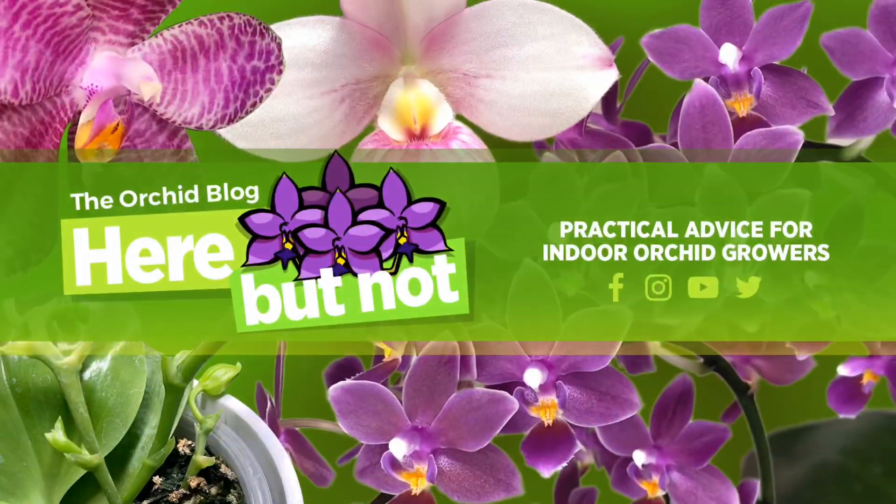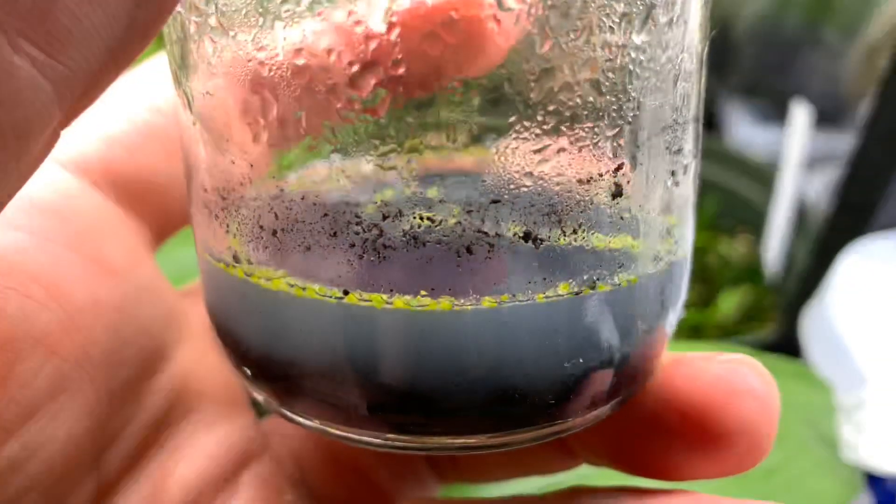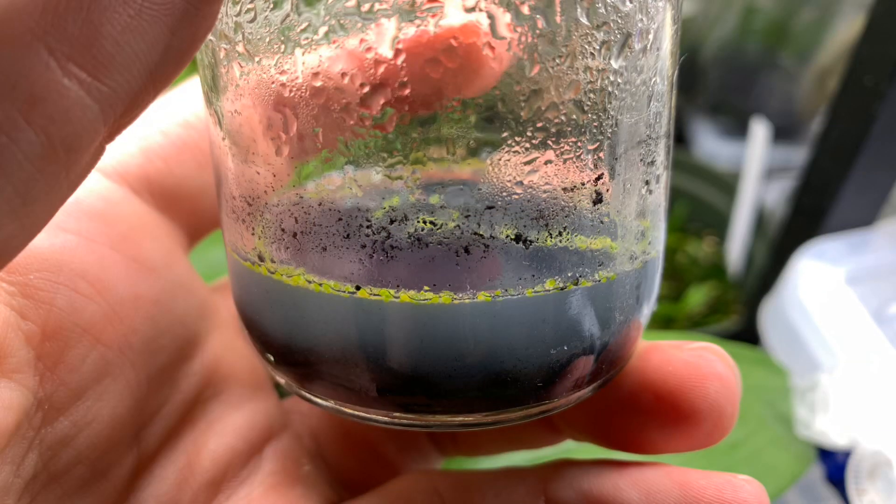Hey plant peeps! What's up? Welcome back to another video from Here But Not. It's been a couple months since I posted about those seedling Phalaenopsis palins, and I wanted to do a quick update and show you how they're doing, as well as walk you through the rest of the flasks that I have on the go, because some of them are getting pretty big right now, which is awesome. So let me round those up and let's do some show and tell.